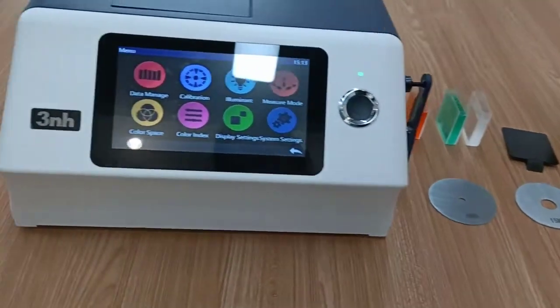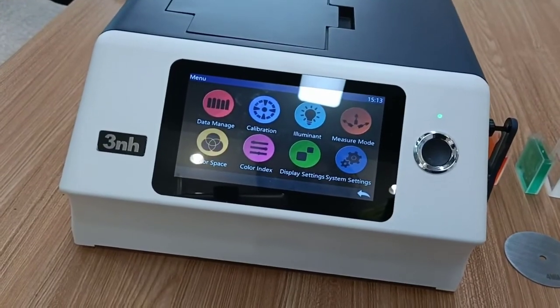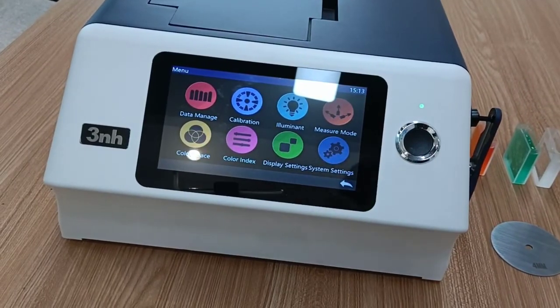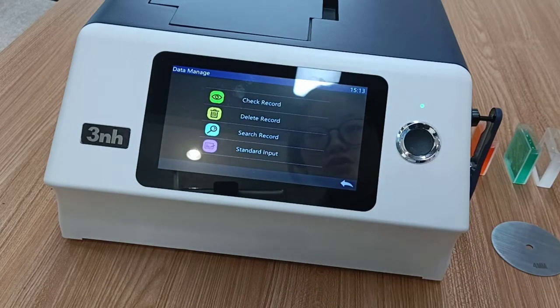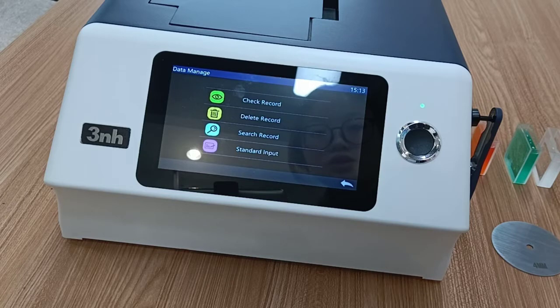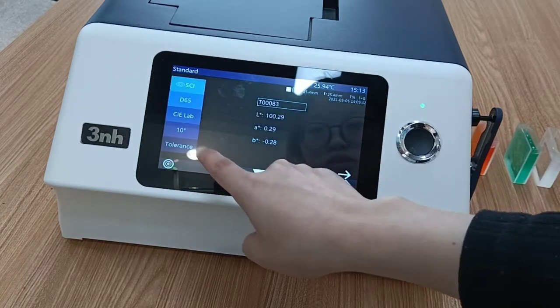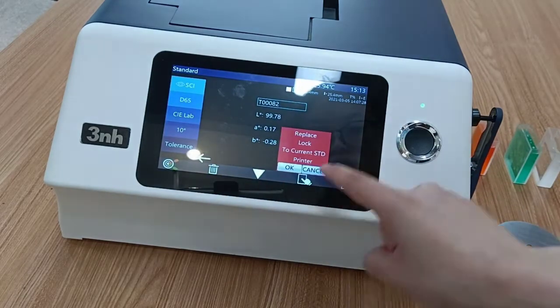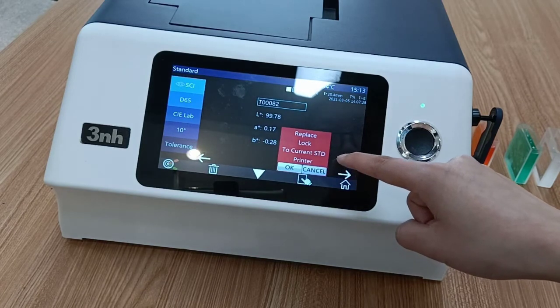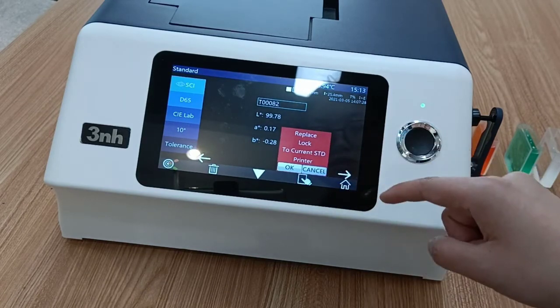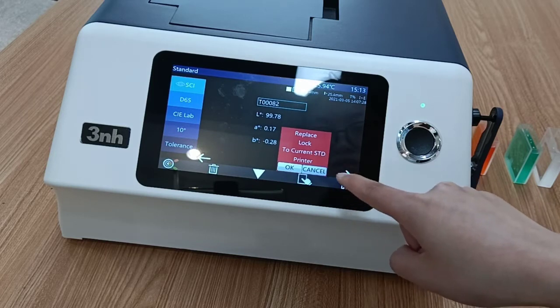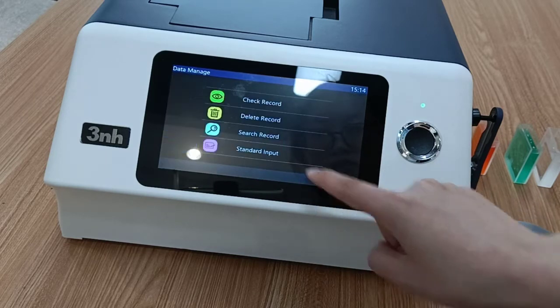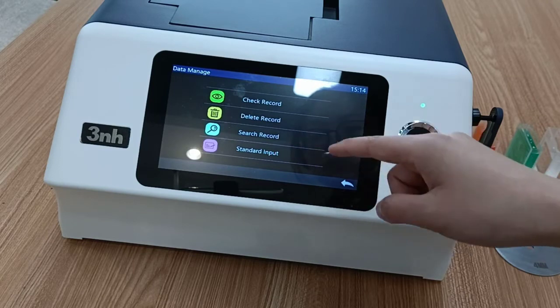Now we can see the main menu. The first one is data manage. The function is to manage records — we can check, lock, replace records, set a record to current standard, or delete and search records.